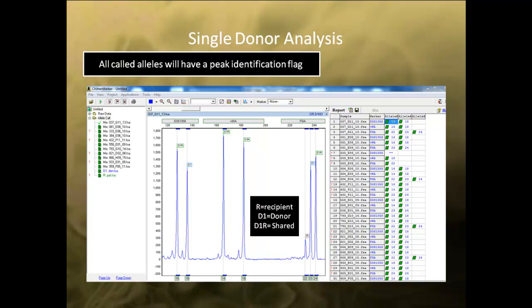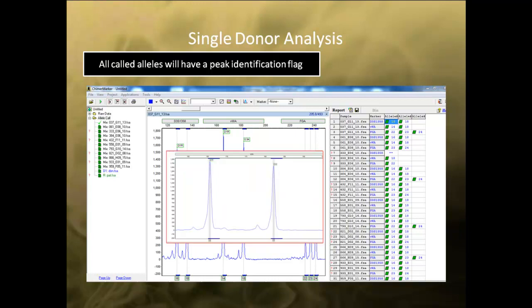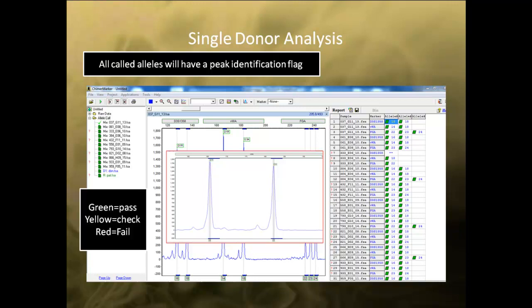You can scroll left or right by right-clicking on the electropherogram and holding to scroll. To zoom in, use a left mouse click and draw a box from the upper left to lower right. To zoom out, click and draw a box in the opposite direction. On the left, all the samples in the project are listed. Green sheets beside each sample correspond to the size call quality: green means the sample passes, yellow indicates the sample needs to be checked, and red means the sample failed the size call.